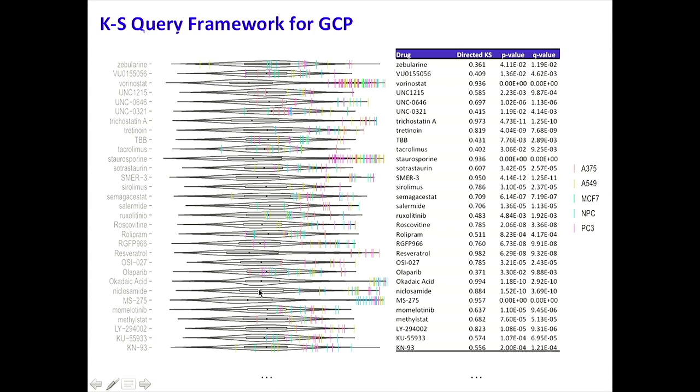And then we can do this also not only for phosphosignaling, but we can do it for chromatin profiling, and we can use these statistics to play some interesting games and go hunting for hypotheses. Again, now I'm showing you many different drugs, and just looking at their own replicate recall. Again, things are generally kind of finding themselves, not in all cases, but in many cases, now using chromatin signatures.